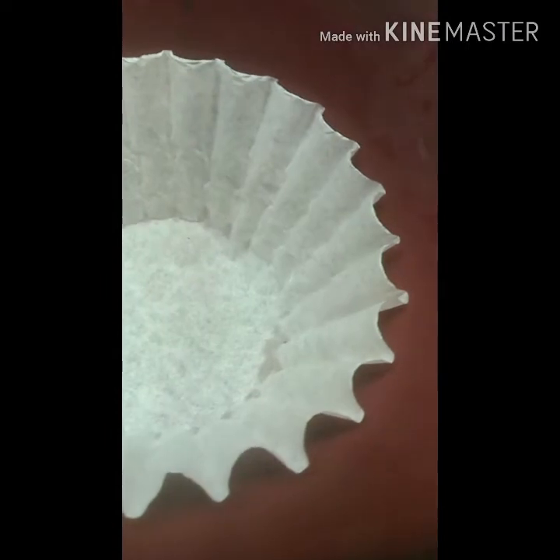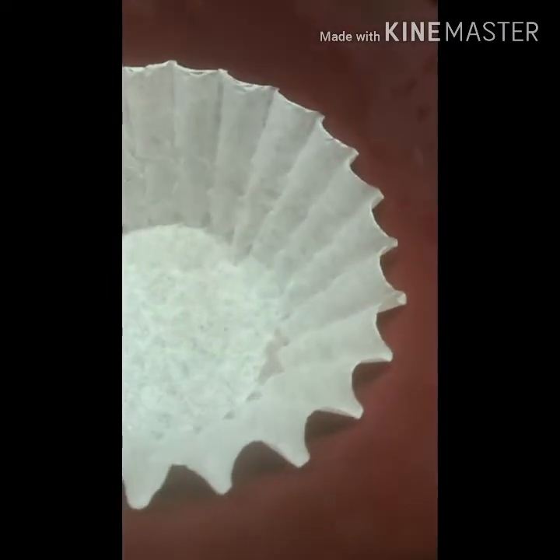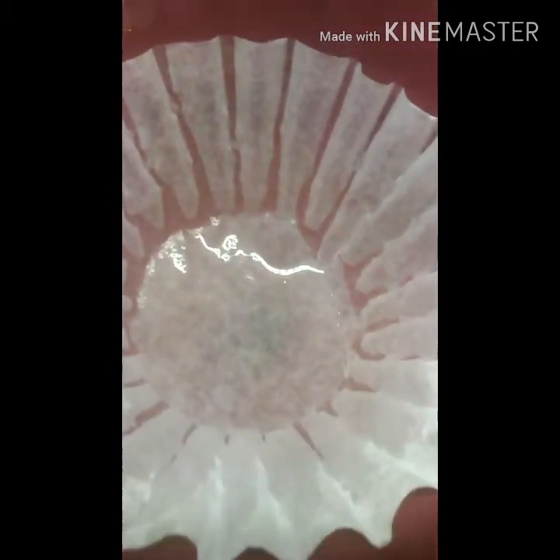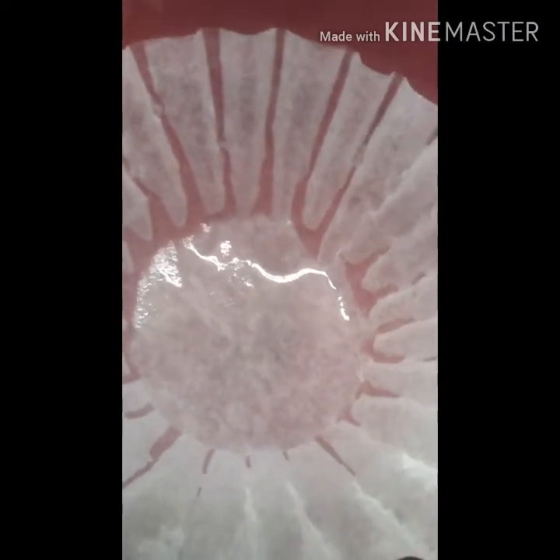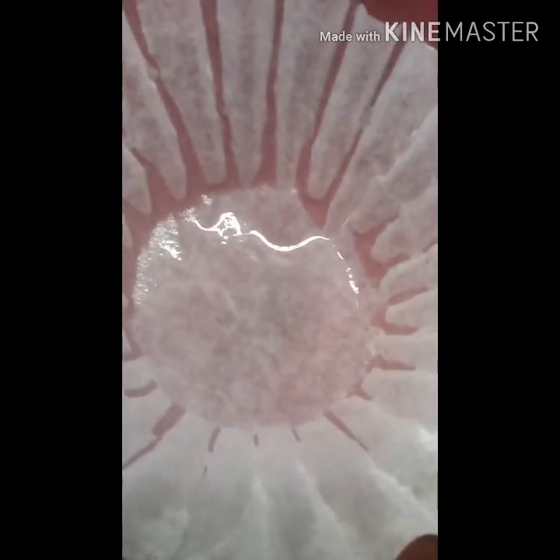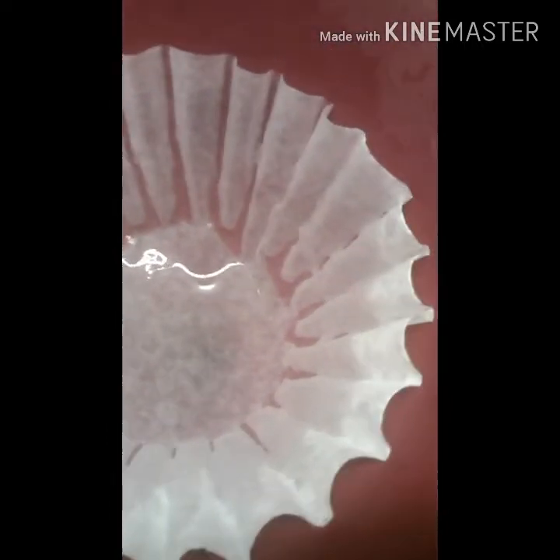Also, if you use calcium ammonium chloride or nitrate, that is alright from the instant cold packs. Whether you get ammonium nitrate or calcium ammonium nitrate, both will work. After you get your ammonium nitrate and your water and it's all stirred up and dissolved, you're going to want to let it sit for a few minutes and then filter it.